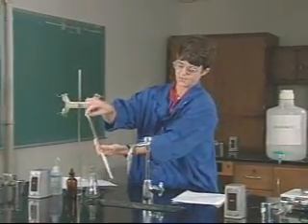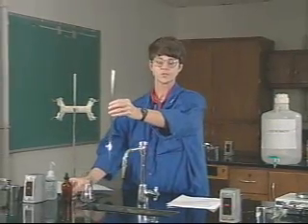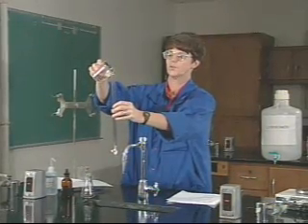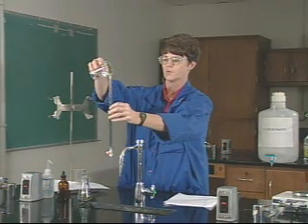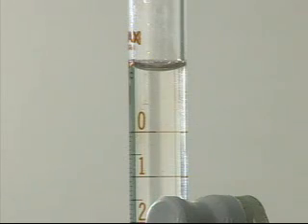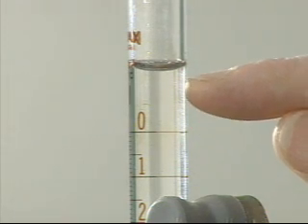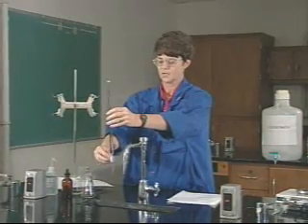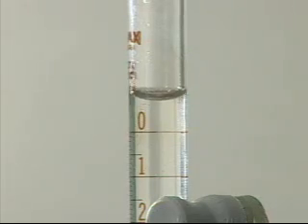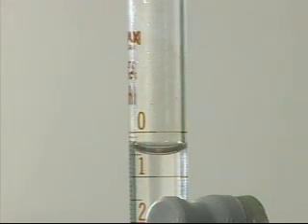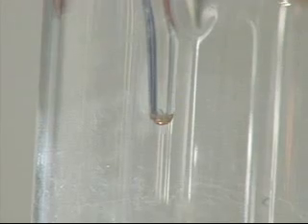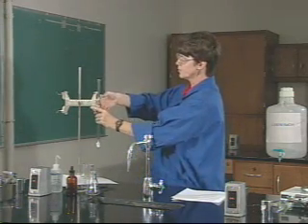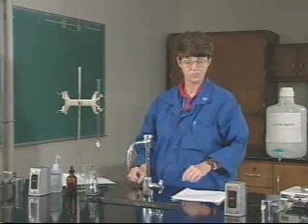Next, get the burette ready for the actual analysis. Add sodium hydroxide to the burette so that it goes above the zero mark, then let some run out until it's below the zero mark. That way, you'll be able to get an initial reading. Also watch out to ensure that the sodium hydroxide runs out cleanly through the tip and that there are no air bubbles in the tip. Once you have done those two things, return the burette to the clamp and leave it while we get the sample.